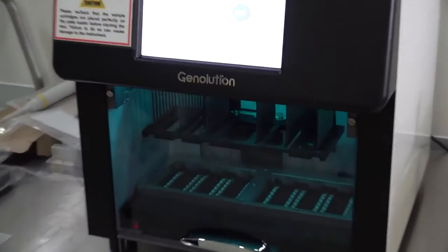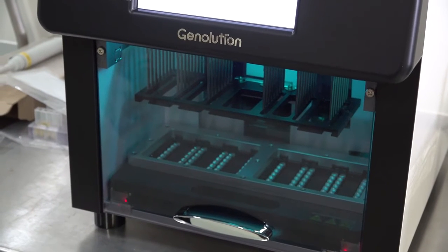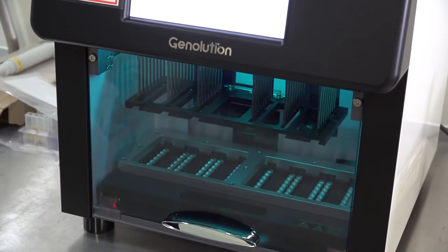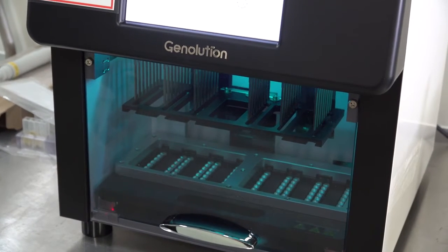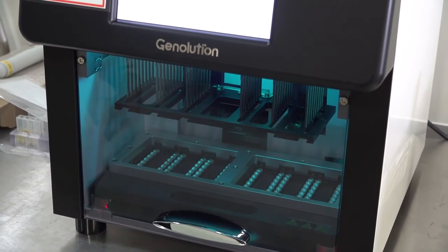As you can see the UV light has been activated in the unit. This ultraviolet light will have a lifespan of 100,000 hours, operational hours. And this does not require changing at any given point of time in the life cycle of this particular instrument.